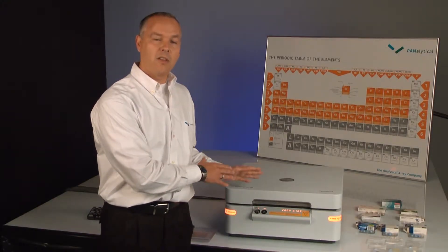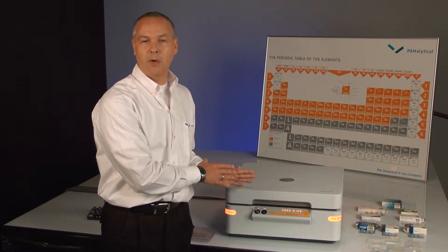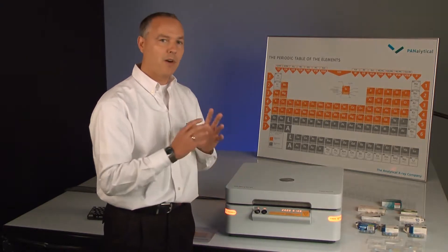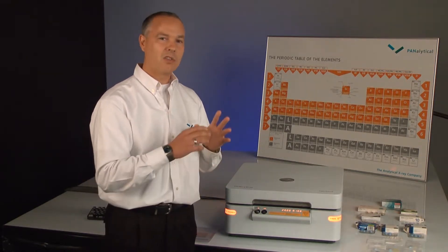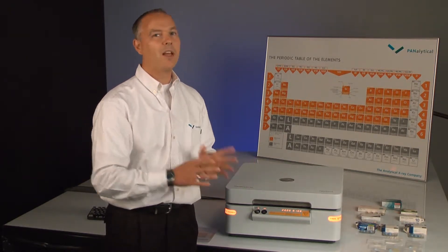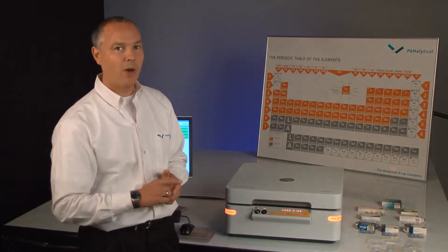Equipped with the latest state-of-the-art electronics and optical components and a very comprehensive software package, it's extremely powerful and very easy to use, and I'll show you how.